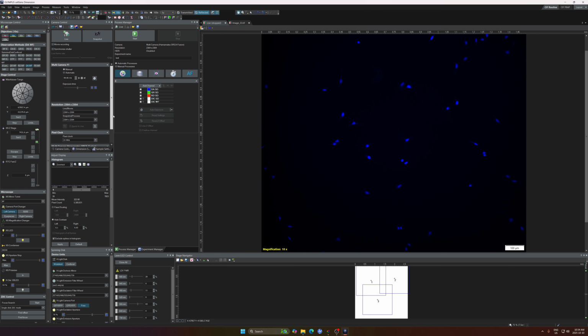So for the camera, there's one very important parameter, basically this pixel clock. This basically tells the camera to run at a high speed or a lower speed. The high speed means the camera will be noisier, but it runs faster, while lower speed will be quieter with less noise. For a speed-sensitive experiment, you can run this faster.